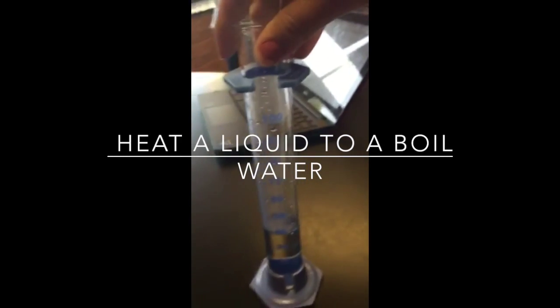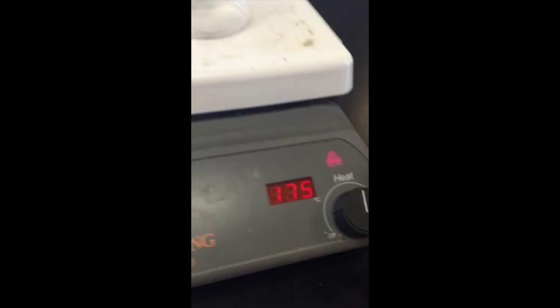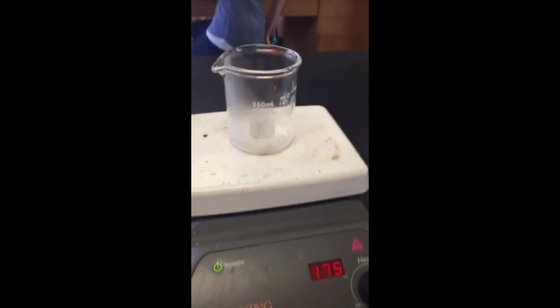We're starting out with 40 milliliters of water and the heat is on 175 right now, so it's a low heat. The beaker is on top of the stove, so I'm going to pour the water in slowly.